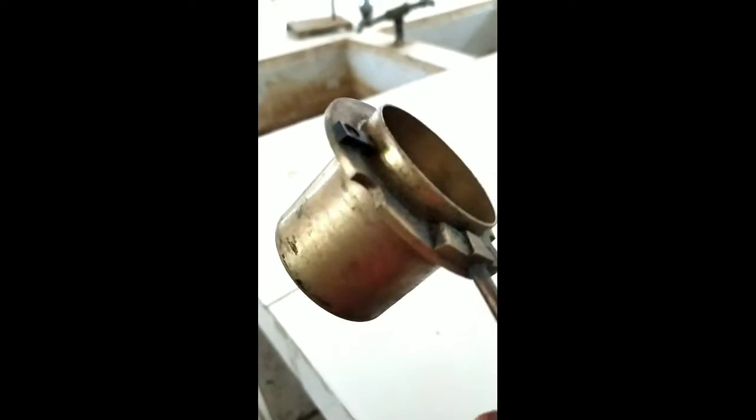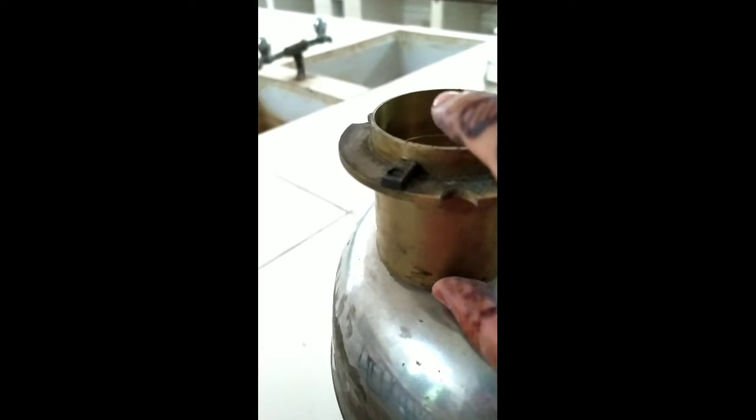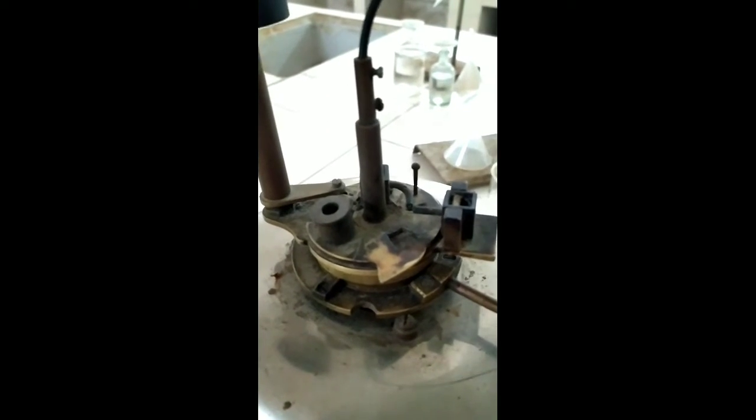The oil cup measures 5.5 centimeter depth and 5 centimeter diameter, and this is the flange. It acts as an air bath. It has a hollow space, and in this space air is filled, so it acts as an air bath. And this is the lid, and it has 4 openings. First is for the stirrer, and we can stir the oil for uniform heating. Second opening is for the thermometer.